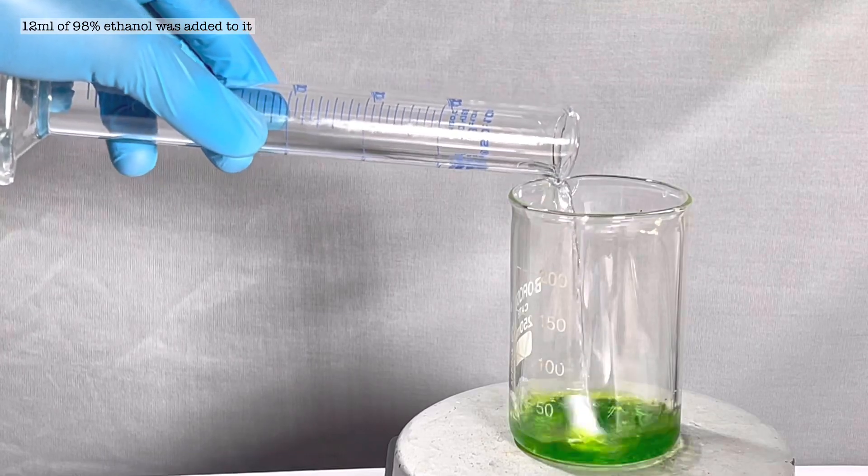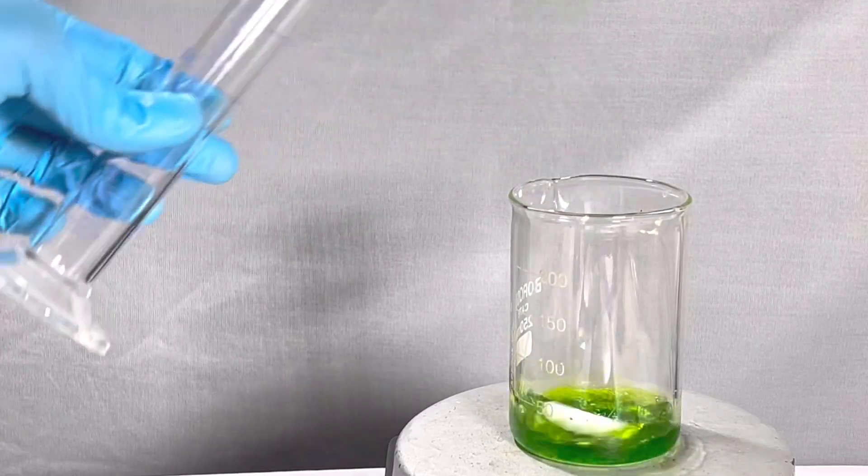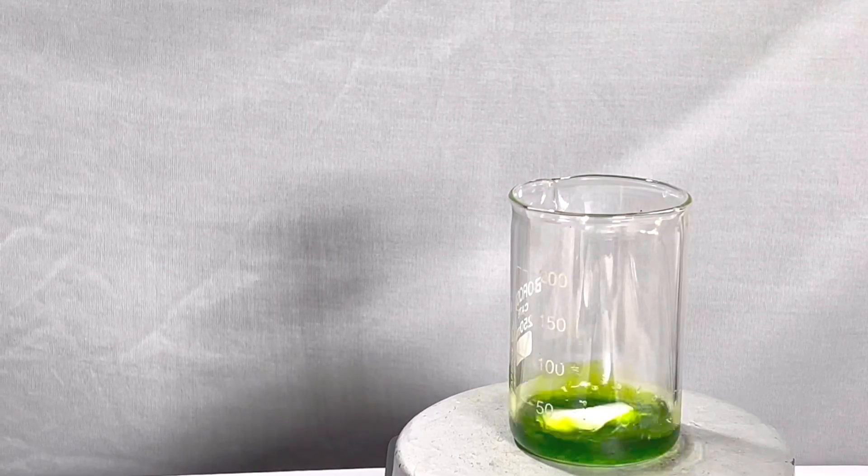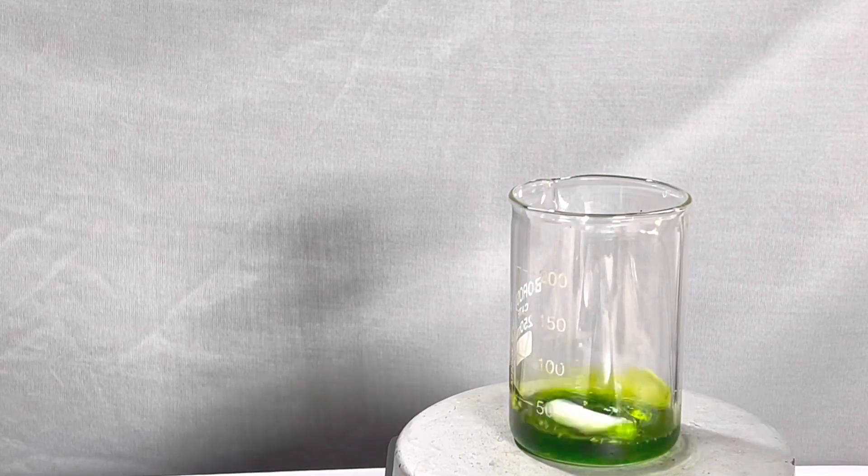Do not use diluted ethanol as this will not favor the production of the complex. It took around 20 minutes of continuous stirring to dissolve all the copper chloride and finally we are left with a clear dark green solution.